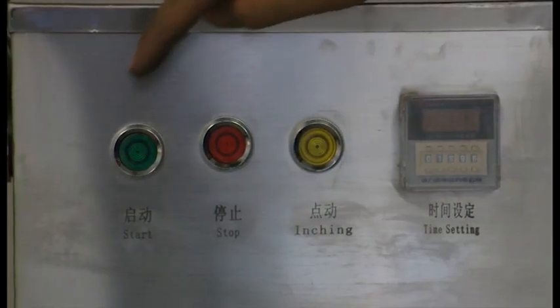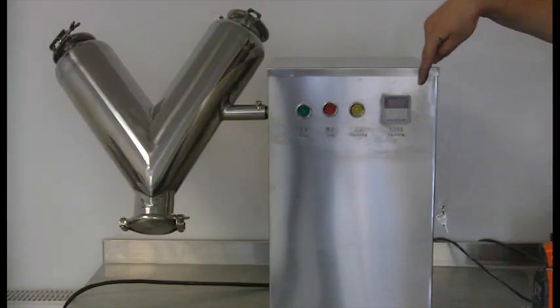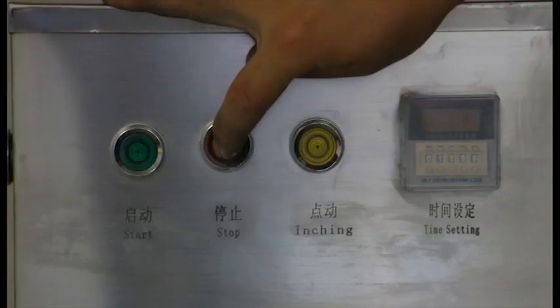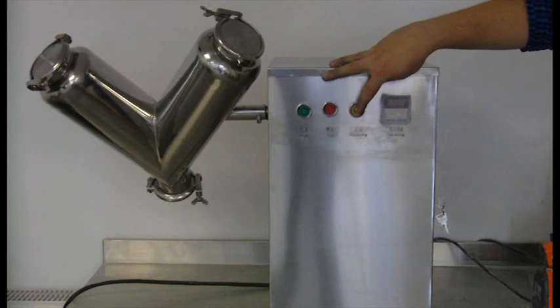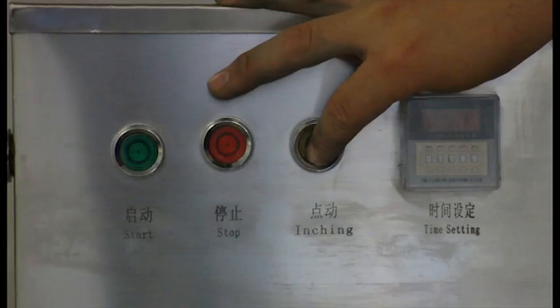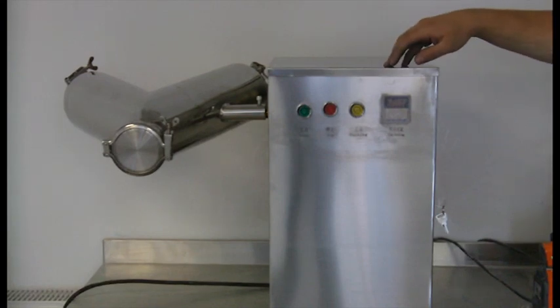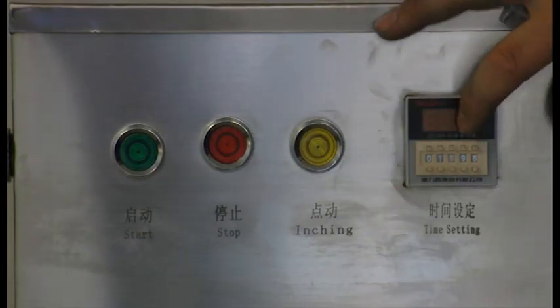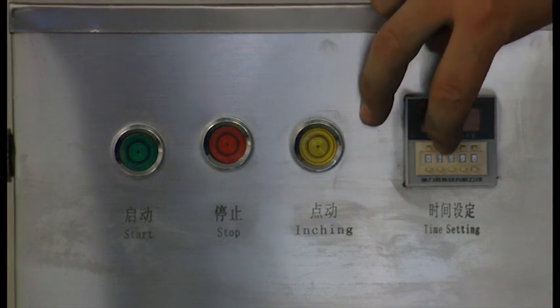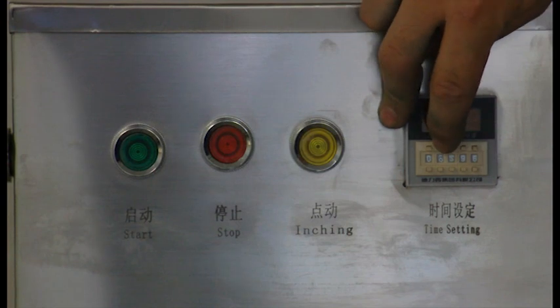The VH8 comes with a simple control panel that includes a start button, a stop button, and an inching button for rotating the cylinder into position for filling or emptying. It also has a timer setting, which enables the operator to set the time so that it counts down to the point where the machine will stop, allowing the operator to not be present while mixing is occurring.